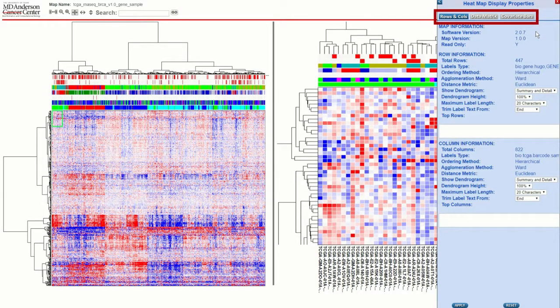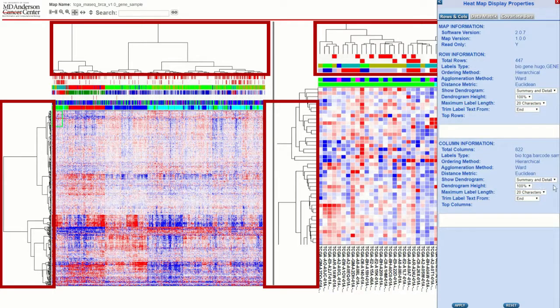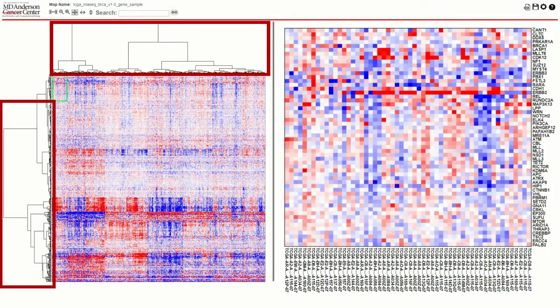Within that drop down there are three tabs. On the first tab is information about your rows and columns. Here you are able to adjust your dendrogram. You can either show it on the summary and detail views, only the summary, or hide it completely.